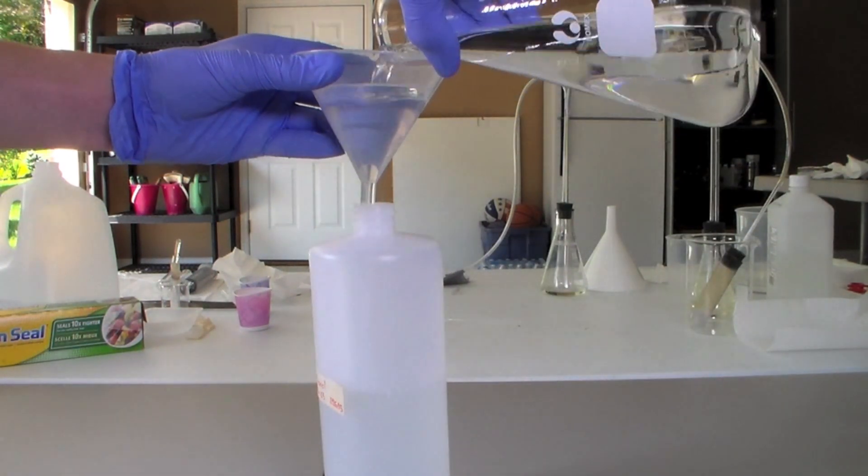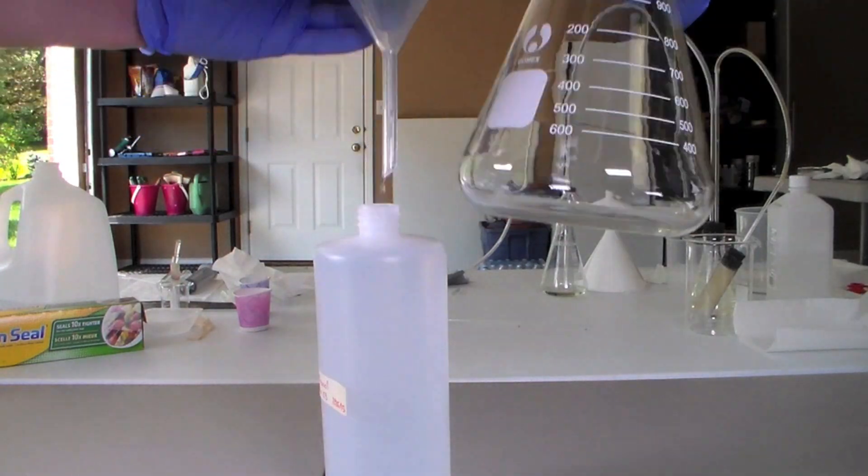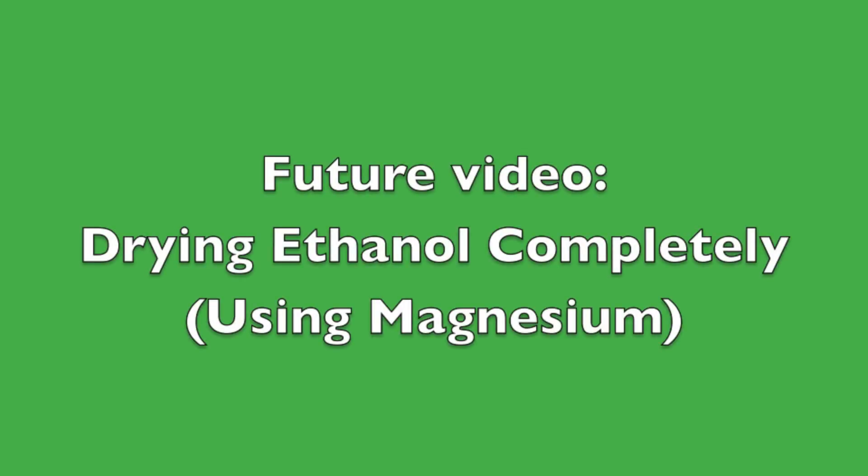The ethanol was transferred to a one liter HDPE bottle for storage. In a future video I will show how to completely dry ethanol for highly water-sensitive reactions.